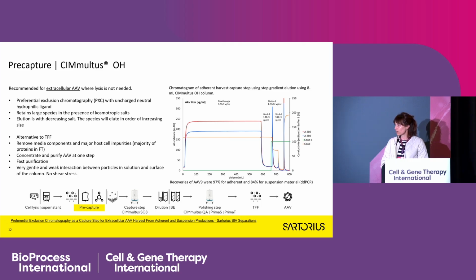So the purification is really fast. It's also gentle because there are weak interactions between particles and solution, so the particles in solution and the surface on the column. And of course, there is no shear stress.